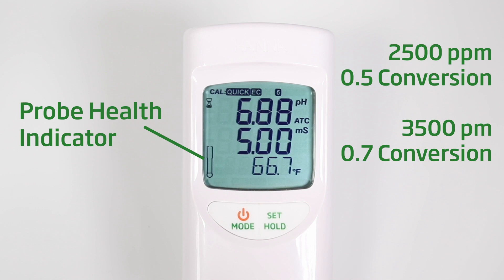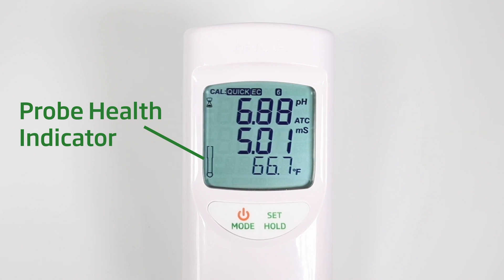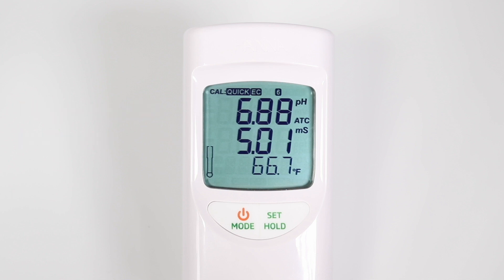Keep in mind that the probe health indicator icon will remain blank when you calibrate with quick cal. A blank or empty probe health indicator simply means there is no information to be displayed. If you would like to know the health of your probe, you must perform a two-point calibration in standard calibration mode, or watch our video on how to interpret millivolt readings in relation to the health of your probe.